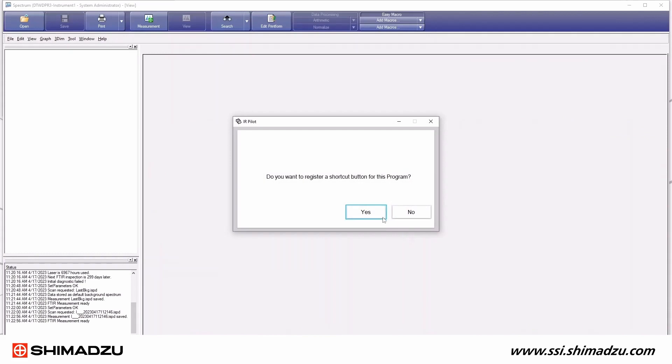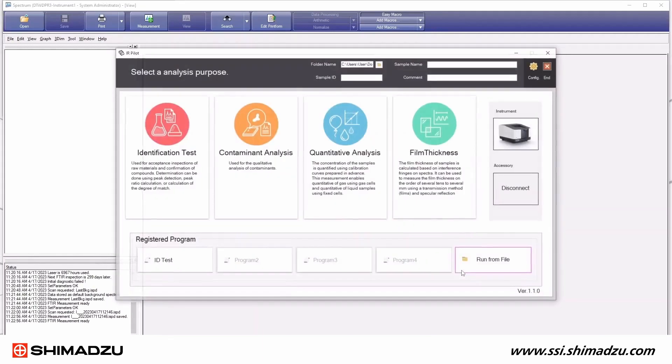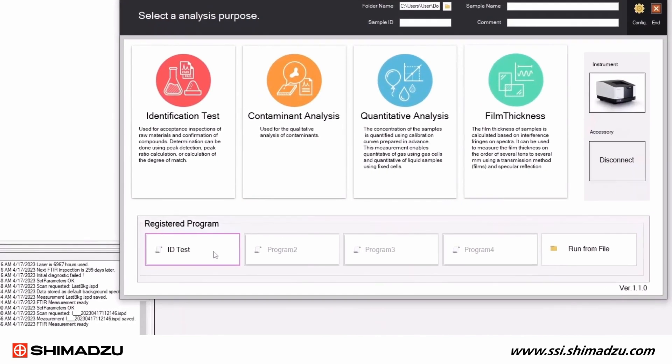Once this workflow is completed, the same steps can be saved as a program. The next time someone needs to use the IR CROSS, they can simply click that same program to follow the same exact steps.